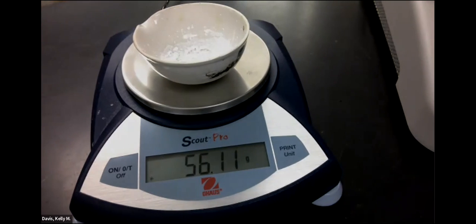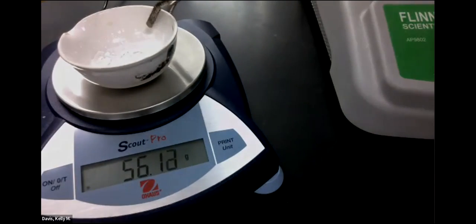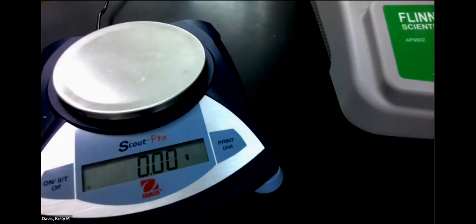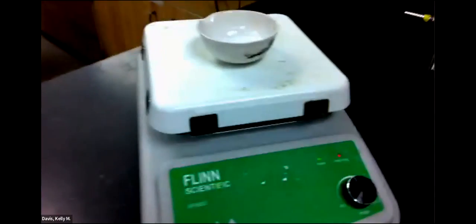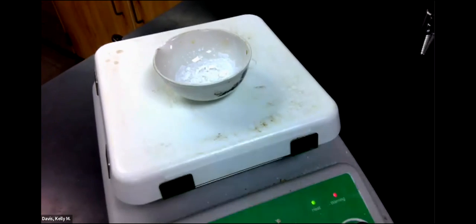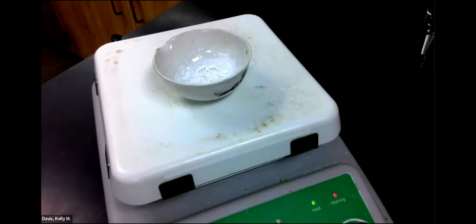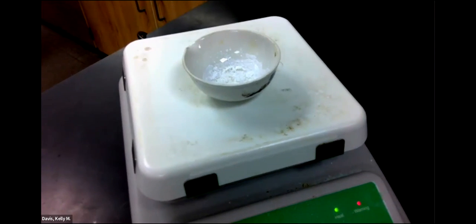And then I really want to make sure that it's all the way dry. So I'm going to put it back on the hot plate just for a few minutes. I left the hot plate on, so it's still hot. I want to make sure that it doesn't crack or break, so I'm not going to leave it on there too long. I just want to ensure that all the water is gone. And when we weigh it again, it should have the same mass or close to the same mass as before.